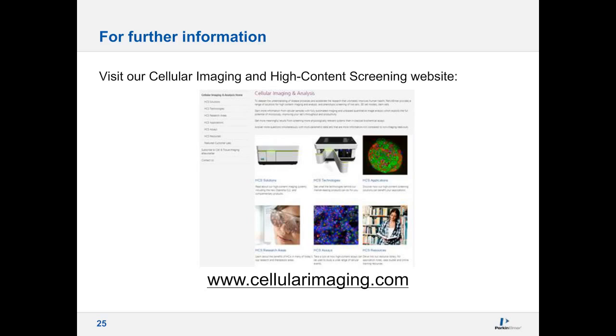Thank you, Joe. Next question. Is there an option of having a color camera or a color filter on a monochrome camera?